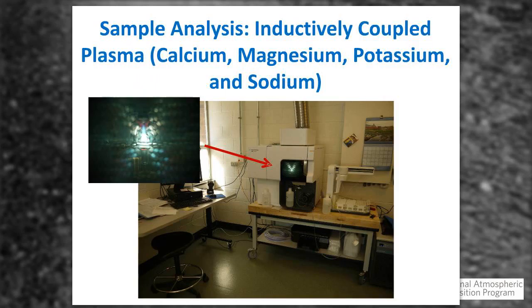Let's go on. And then this shot, I like this. This is my favorite instrument. It's actually a new one we just received this year. It's an Agilent inductively coupled plasma spectrophotometer. And I went to the lab, and Katie Blades, who ran it, was down for the day. She kindly let me do some close-ups.